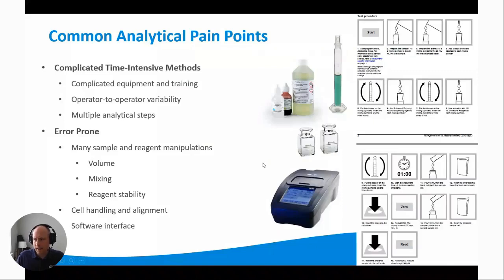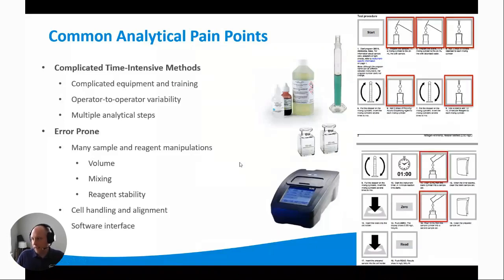So what do I mean? Let's just look at some of the steps here. There's reagent additions, and in each one of these steps, there's an addition of a reagent to the sample.